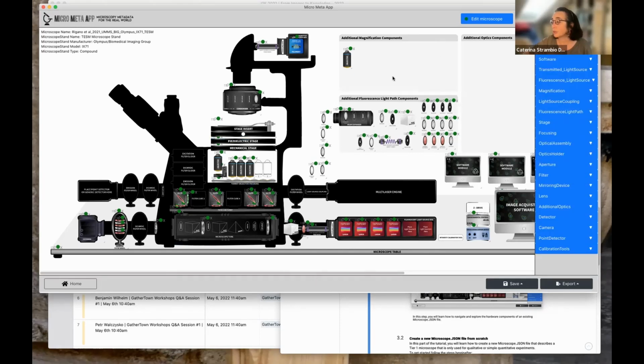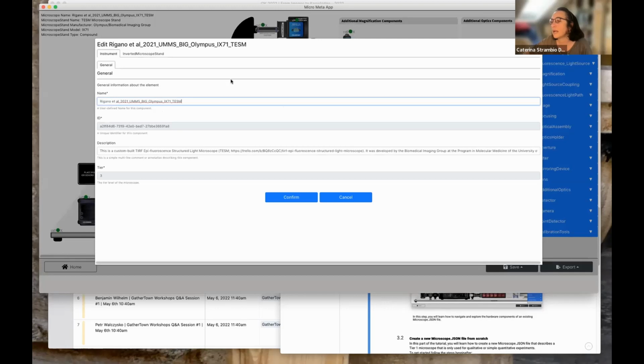So you see, I told you about hardware, but here I show you software. We capture basically the unchangeable parts of what exists associated with your machine, that is, a priori before you acquire any images. The first thing I can show you is the general information written here. Here you can see general information about the microscope, and to access that information, we can click on this button here. And here you can see the general structure.